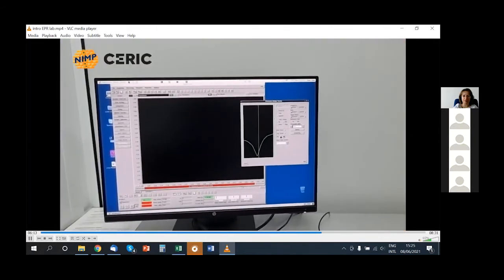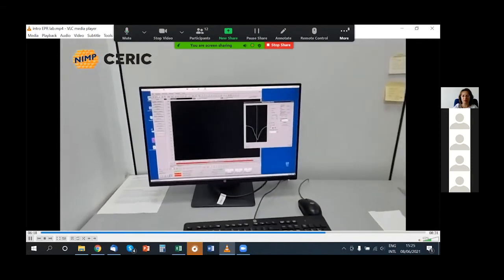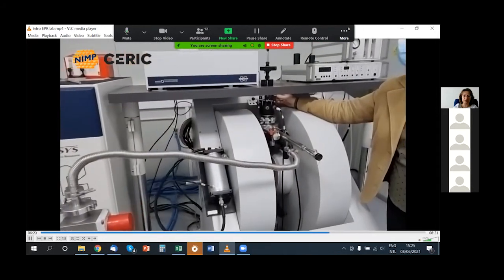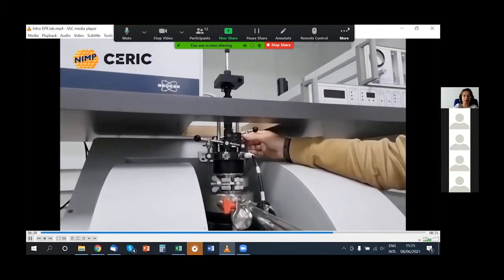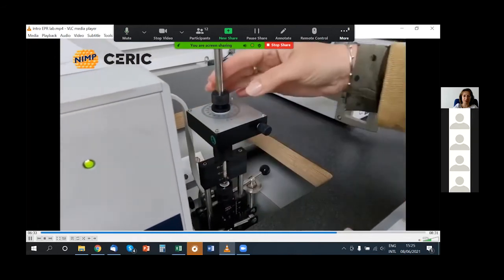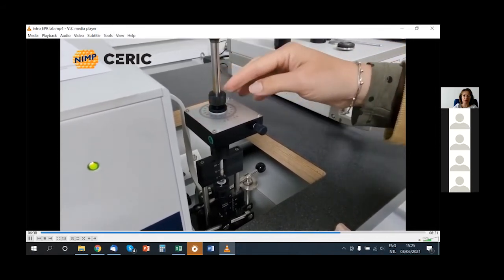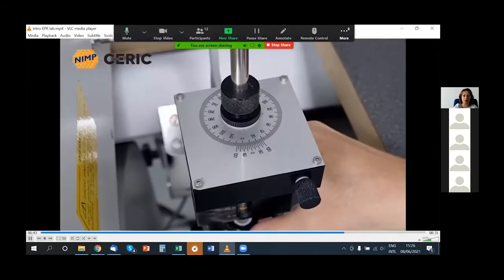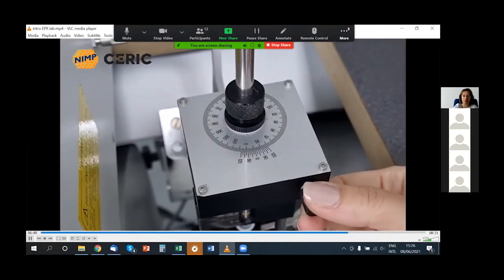Again, the cavity dip is moving. The frequency is changing by inserting the sample. And we are doing here some small adjustments of the cavity length. You know, when you change the length of a resonant cavity, you change its resonant frequency. And here it's the procedure to rotate the holder with the sample in the magnetic field.